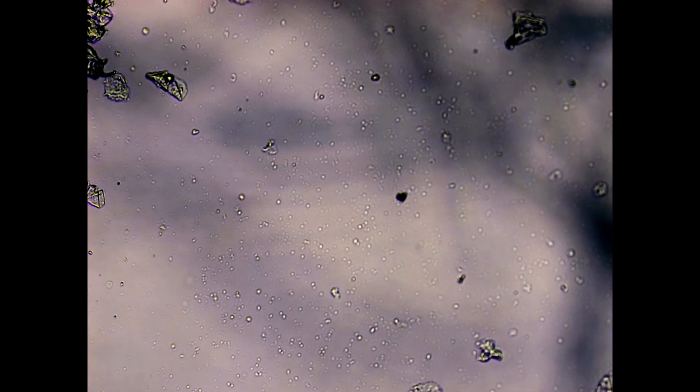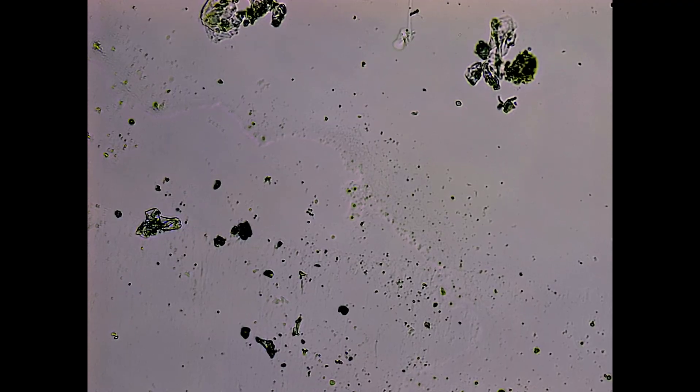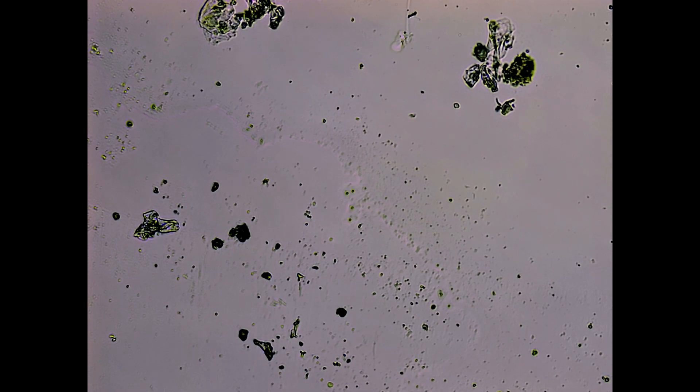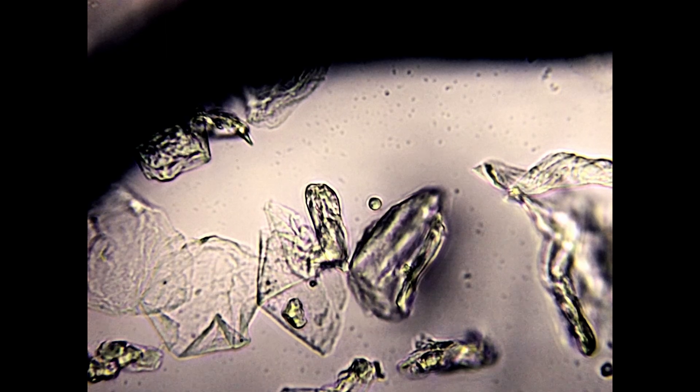Breathe away. Filter your world. Under the microscope, we explore the world we never see. The air we breathe and the threats it carries. You're watching real movements. Live microorganisms trapped on a filter you might have at home. This isn't sci-fi. This is your living room, your bedroom, your lungs.